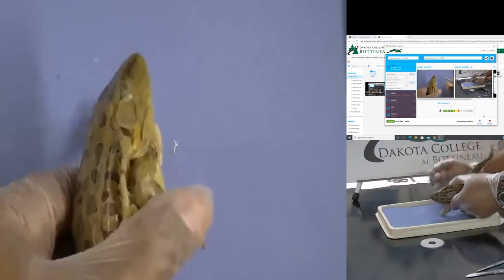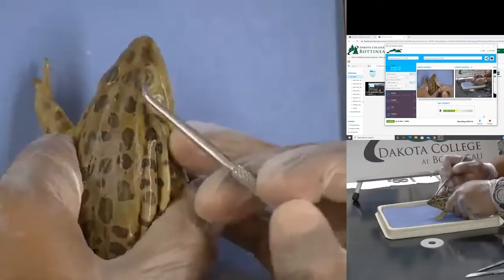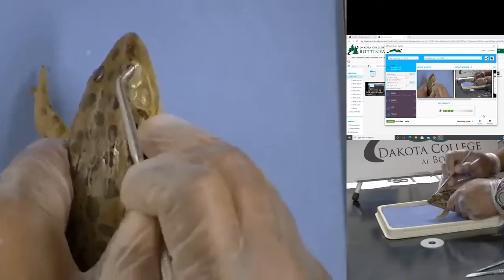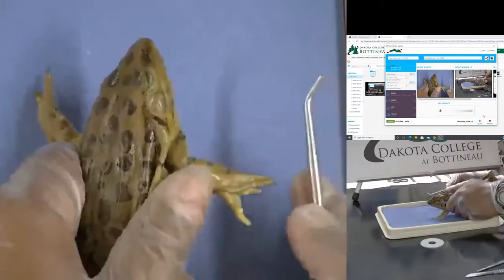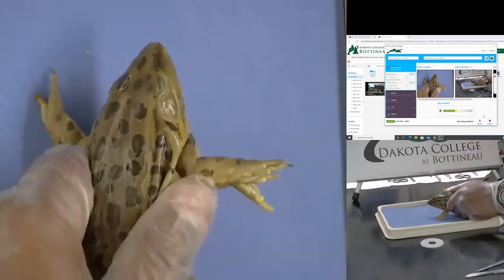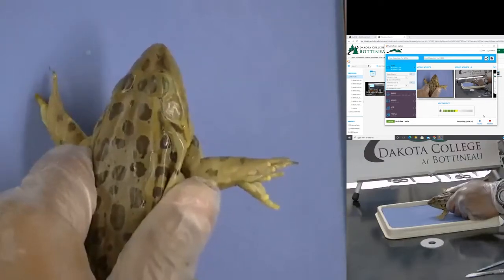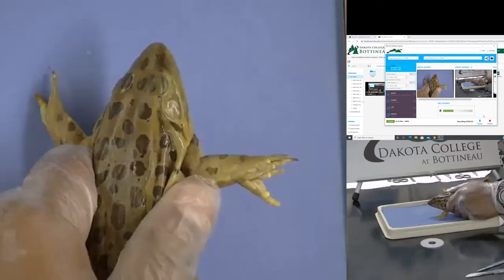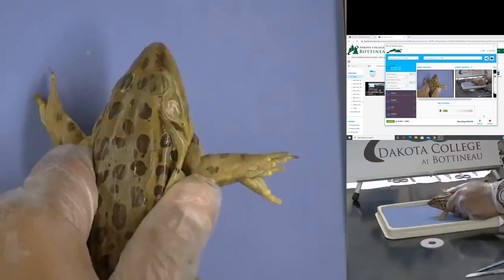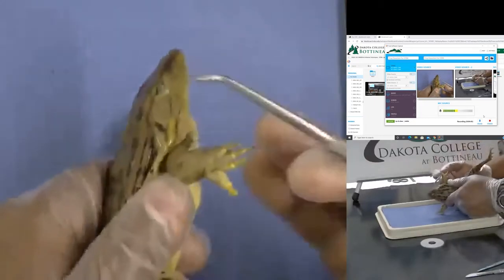So that's the tympanic membrane. That's the eye. On top of the eye, you have this membrane right here. That is called a nictitating membrane. That membrane is a translucent, almost transparent membrane over the eye that they can close and open. Our nictitating membranes have degenerated and formed the pink area called the canthus on both sides. You have the medial canthus by the nose and the lateral canthus on the ends of your eyes. They still have the nictitating membrane.